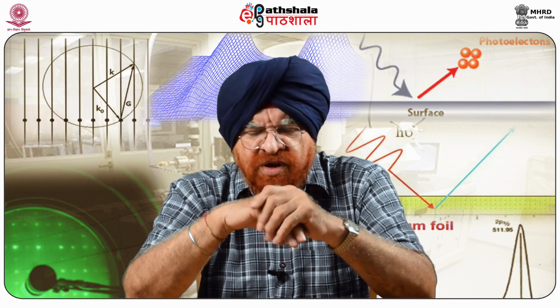This formula is the well-known result of a study called DMT, Derjaguin, Muller, and Toporov theory. In brief, as I said, it is called DMT theory, which assumes finite range surface forces and no deformation. That is zero contact area at the moment when bonds between functional groups on the tip and the sample rupture.